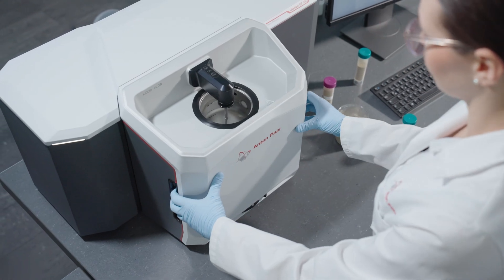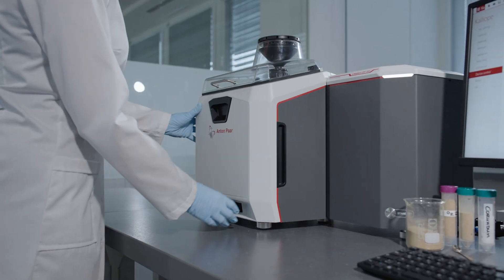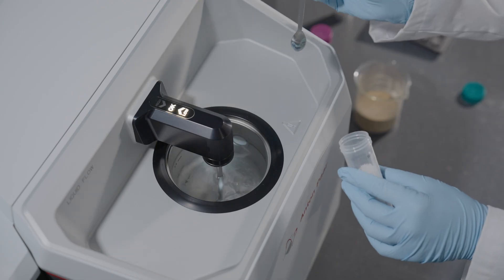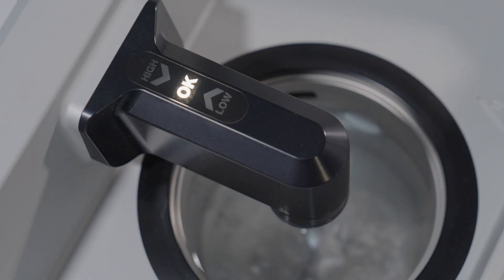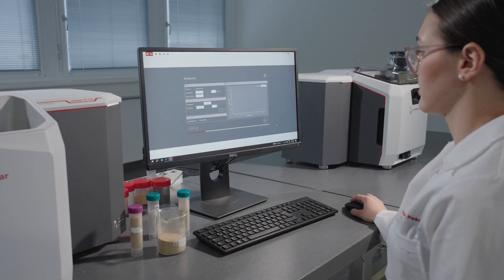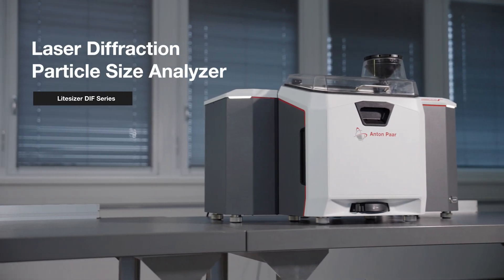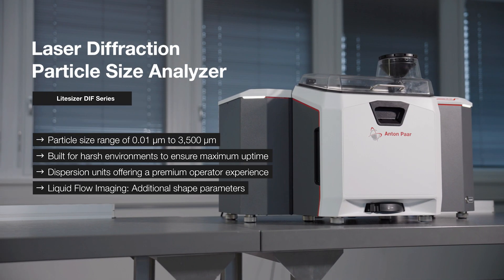The dispersion units can be switched in one move. And the Obscuration Level Indicator lets you monitor and adjust your sample amount directly at the instrument. The Light Sizer DIF series — from first to best — delivering a premium operator experience even in harsh environments.